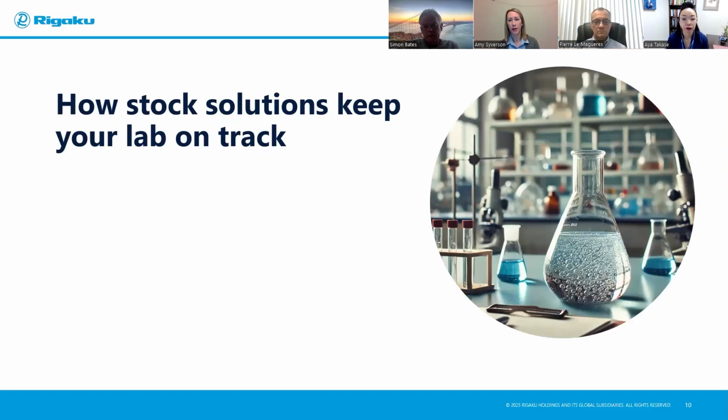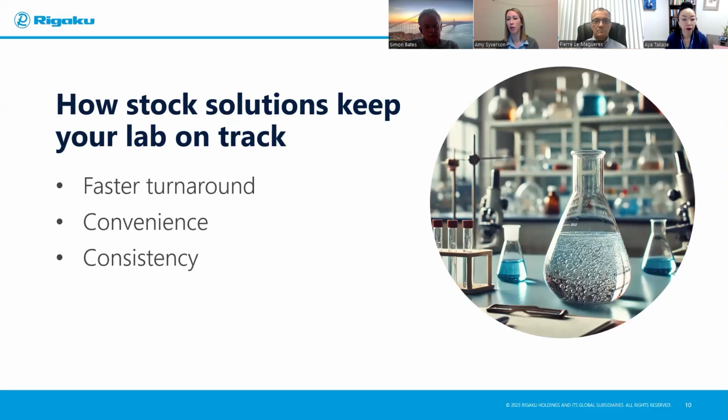So having stock solutions readily available is going to be one of the best ways to improve efficiency in your lab work. Stock solutions, especially buffers, are often needed in multiple steps throughout an experiment. The beauty of preparing these ahead of time is that you're always ready to go when it's time to conduct your work without having to mix each solution from scratch. This simple step will save you a lot of valuable time, help reduce errors and ensure consistency across all of your experiments.